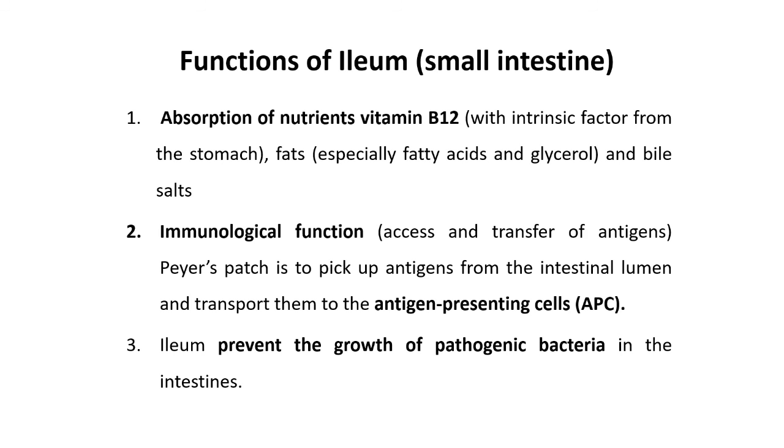Generally in exam the question arises, write a short note on TS of ileum, or write a short note on histological structure and function of ileum.